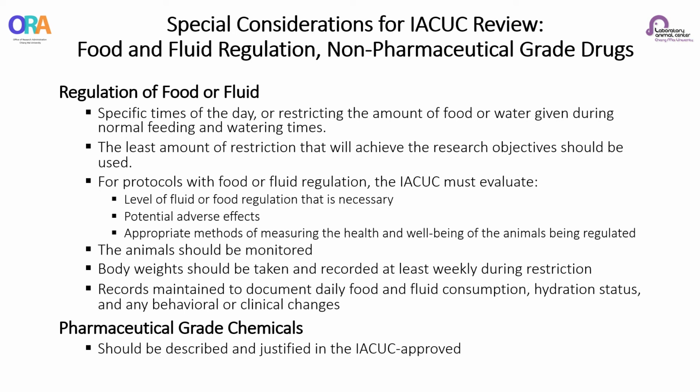The animals should be monitored closely to ensure that nutritional needs are being met. Body weight should be taken and recorded at least once a week during restriction, and written records maintained to document daily food and fluid consumption, hydration status, and any behavioral or clinical change that would signal removal from the study.